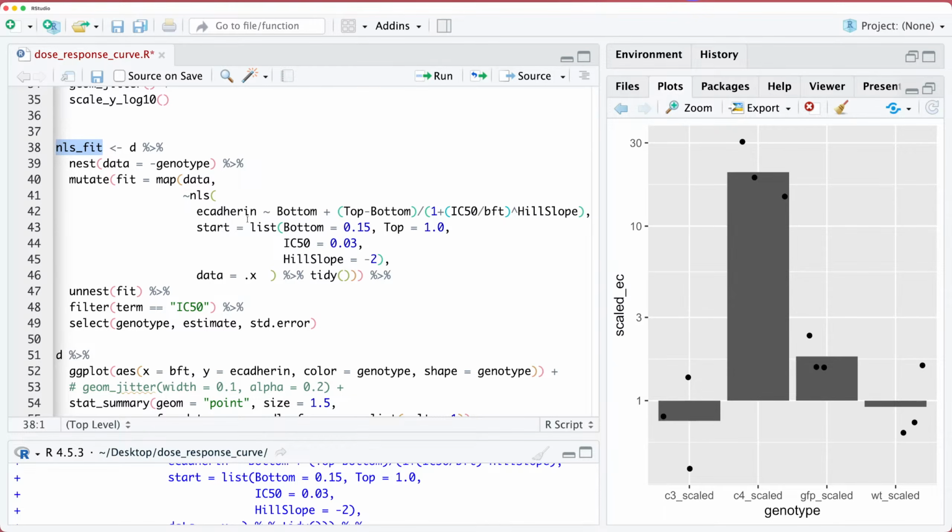Can we extract the fit parameters and SE from the geom_smooth function directly? Not as I understand it. You have to run NLS separately or LM separately from geom_smooth. geom_smooth is not designed for extracting the parameter values directly. You can extract the fitted values, right?